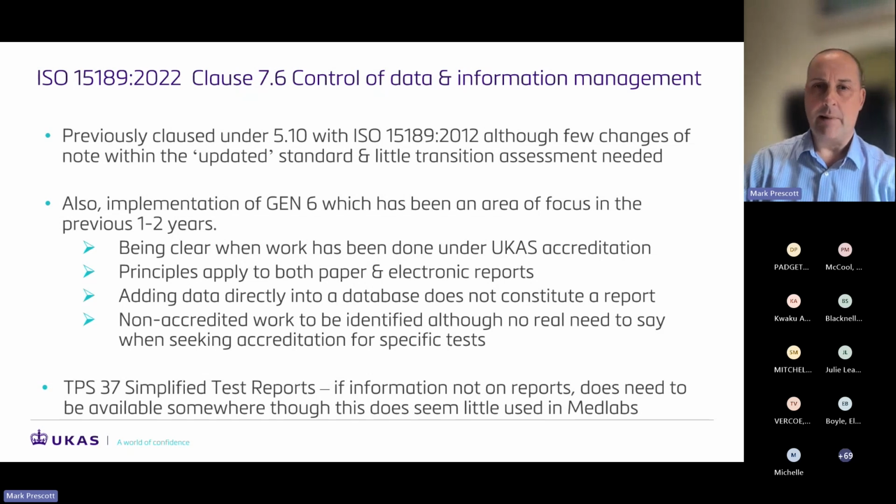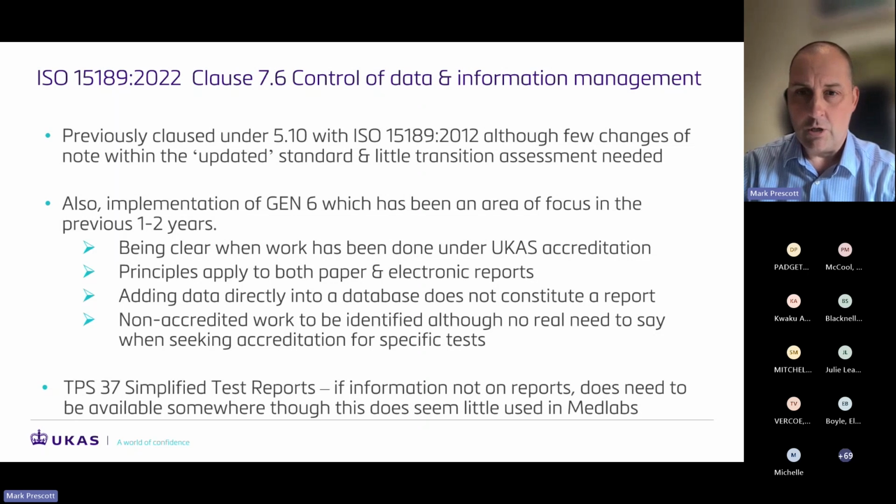But as you say, there are lots of changes going on within LIMS. Certainly over the last year or two, the focus of many people's attention has been on Gen 6, which has been a bit of a thorn in most people's sides, I think, really. This is all about being very clear when work is done under accreditation. The principles of this apply to both paper and electronic reports.